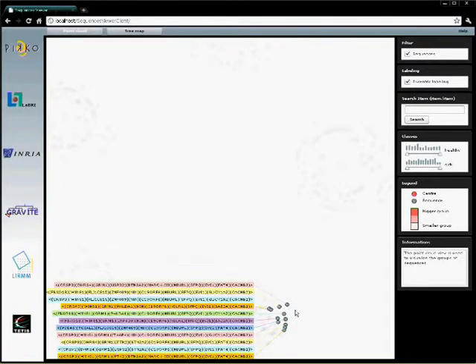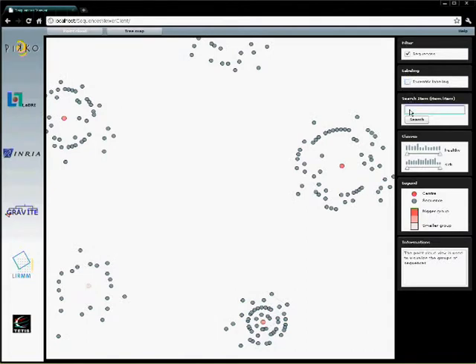The WINS1 gene appears in most of the sequences of this group. We can see it in all sequences. It appears in this group.